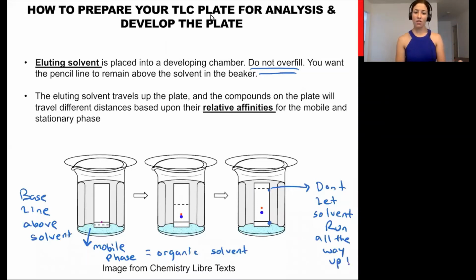Okay. So what happens is if you've had different compounds, what we'll find is that they will travel along the plate at various speeds, meaning one might go really fast up to the top of the plate, traveling higher, as shown with the pink spot on the plate. And the other might travel what we call slower, resulting in it traveling to a lower distance, okay?